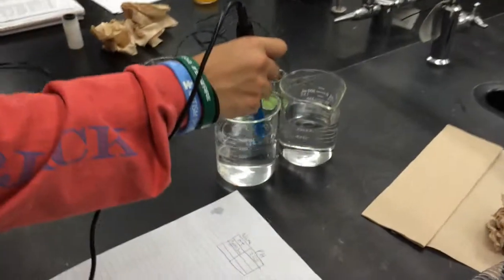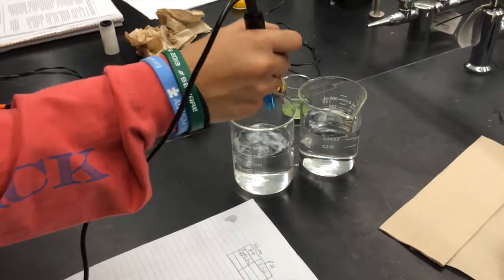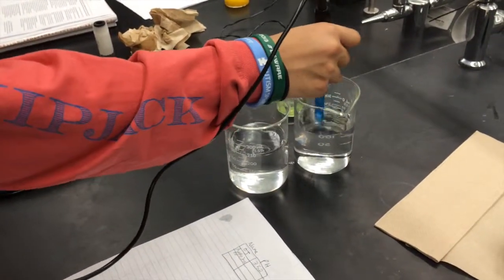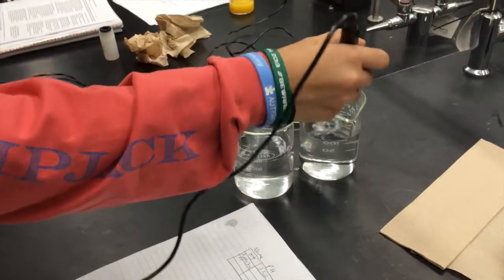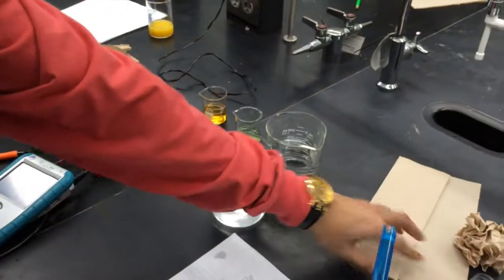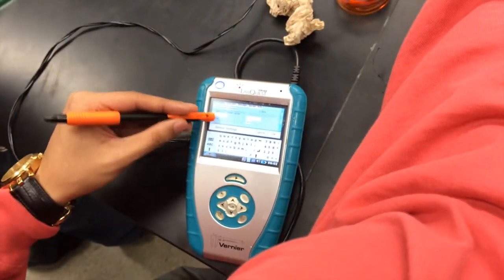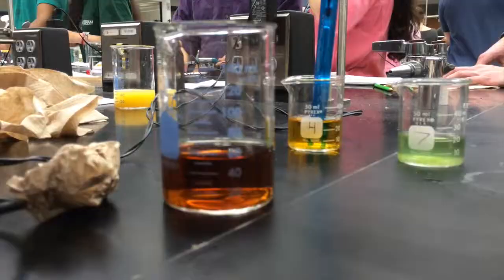Rashik is now preparing the pH probe for obtaining the pH of the 2 buffer solutions. Rashik calibrates for the pH of the 7 buffer solution, and now for the 4 buffer solution.